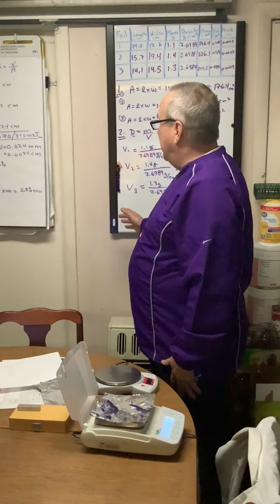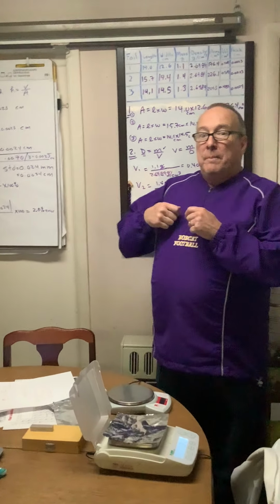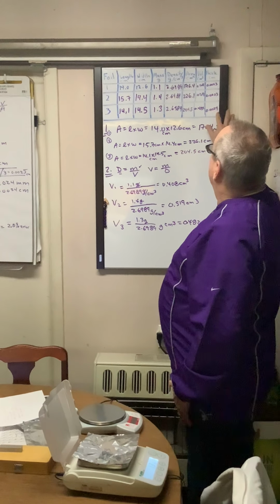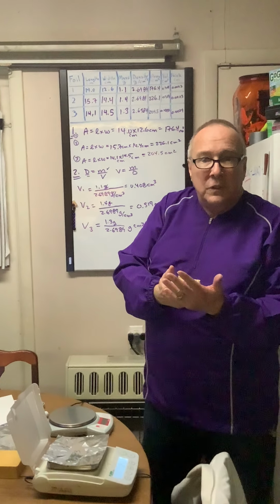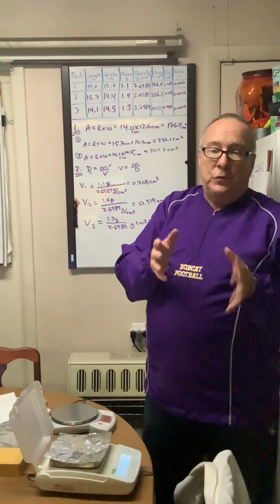But I think that being within 3% of the industry standard for thickness of foil, it's pretty good for a simple high school chemistry experiment measuring thickness of aluminum foil, back calculating from the density. So, some manipulated values. We have 2 sig figs in the end in our thickness. And so lots of concepts there: density, significant figures, units, unit conversions. So this is a really good lab.